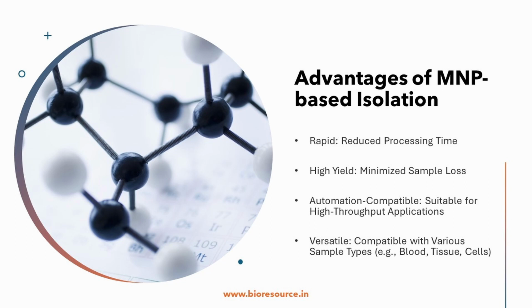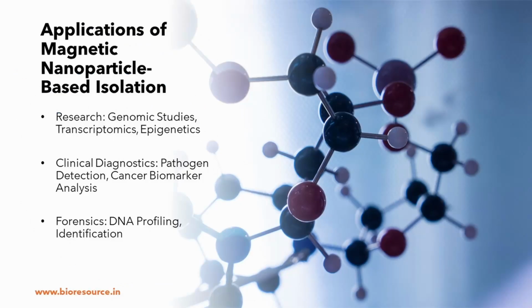So now we have seen a comparison between the traditional method, advantages, and principle. Let's look at the applications of nanoparticle based isolation. The magnetic nanoparticle based isolation has revolutionized the field of nucleic acid isolation due to its speed, efficiency, and versatility. Coming to genomic studies, MNP isolation is a valuable tool for researchers studying entire genomes because of its rapid and efficient isolation of high quality DNA from various sources. The purified DNA can be used for downstream applications like sequencing, gene mapping, and comparative genomics.